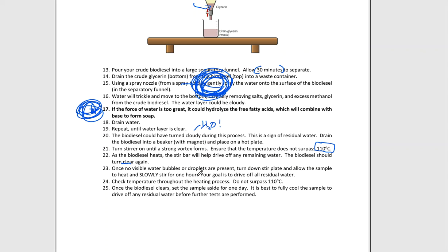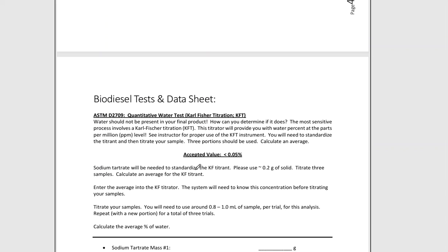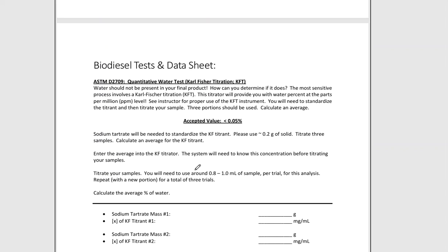Again, do other things while you're working on this. You have to in order to get these labs finished. Next up are all of the tests that come along with the biodiesel product that you have now made. And there's a number of them. So like I said in the very beginning of this live video, it's a whole lot of biodiesel tests. And most of these biodiesel tests are going to be coming from ASTM.